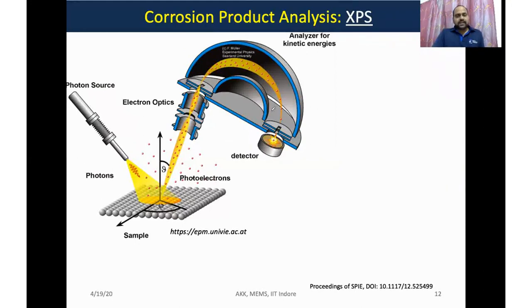And our last spectroscopy technique is XPS, X-ray photoelectron spectroscopy. Let me just give a brief idea about this mechanism. If we have a photon source and this light source is interacting with the material, and it is in a very high vacuum, since XPS generally works in very high vacuum, 10⁻⁷ bar or something, maybe even slightly higher than that.